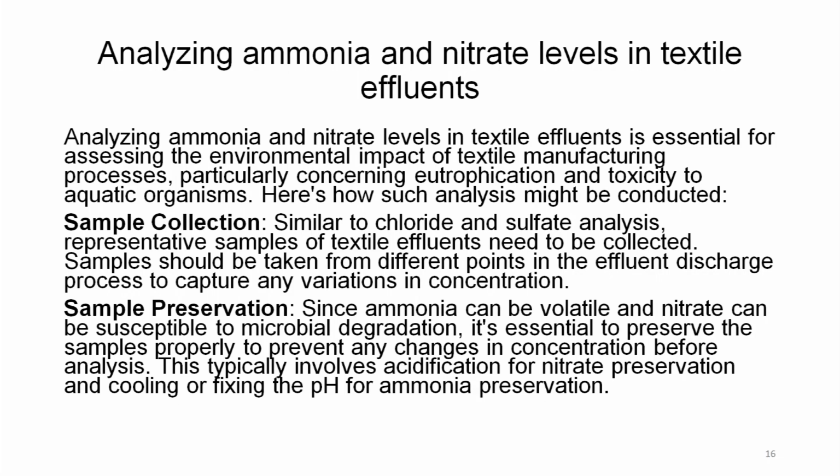Now, let us see how ammonia and nitrate levels are analyzed in textile effluent. Analyzing ammonia and nitrate levels in textile effluent is essential for assessing the environmental impact of textile manufacturing processes, particularly concerning eutrophication and toxicity to aquatic organisms. Here is how such analysis may be conducted.